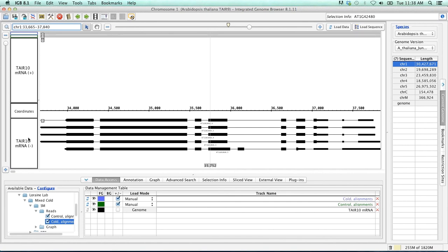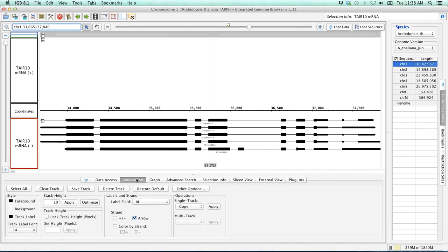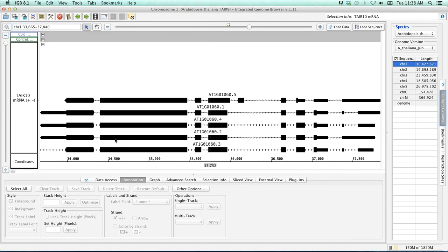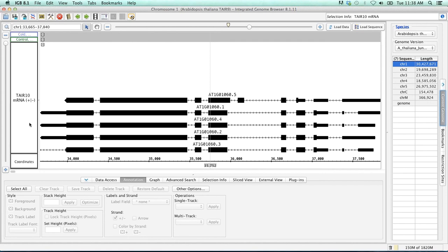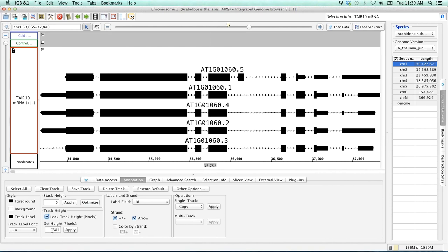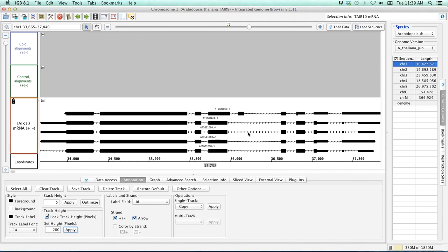So if we click on either the minus or positive strand, go down to the bottom, and click on annotation, we can then combine these two tracks into one using this strand plus minus. Now we can see that all five of these gene models on the negative strand are now combined with the plus and minus strand. We can simplify this a little bit further by changing the stack height. The stack height will change the number of reads or gene models that are currently visible. We're now going to lock the track height at 200 pixels, just to give us a little bit more space to work with. Much better.